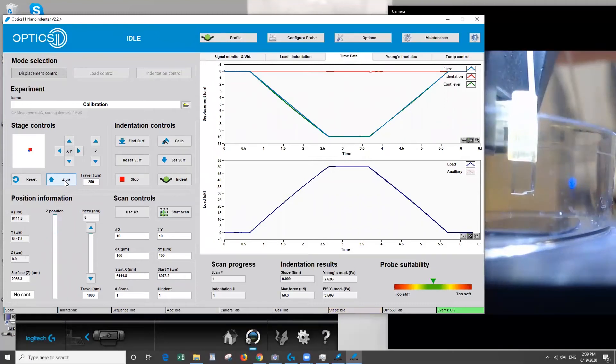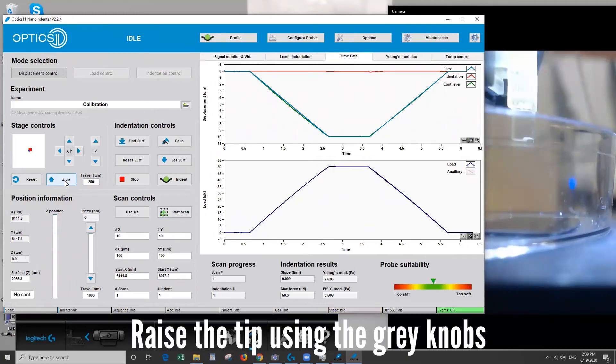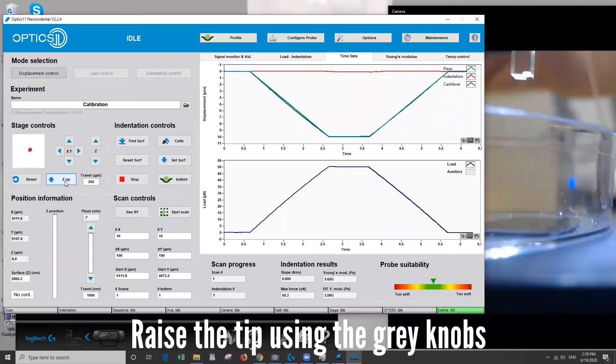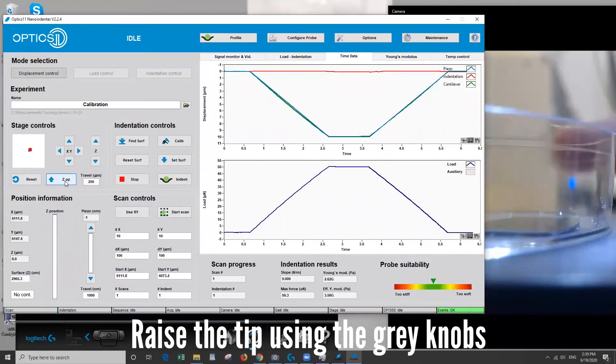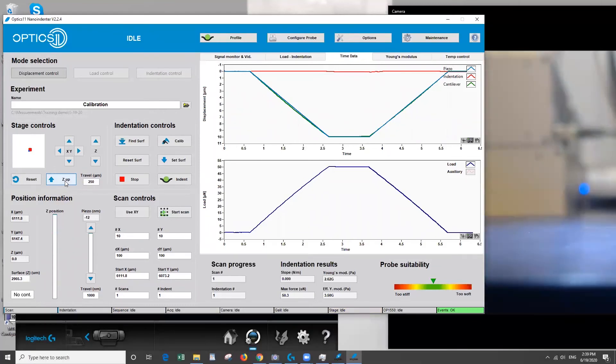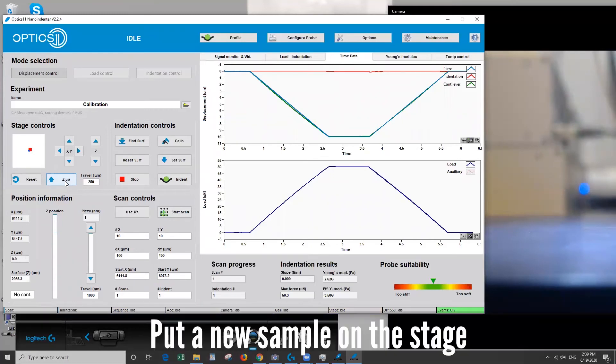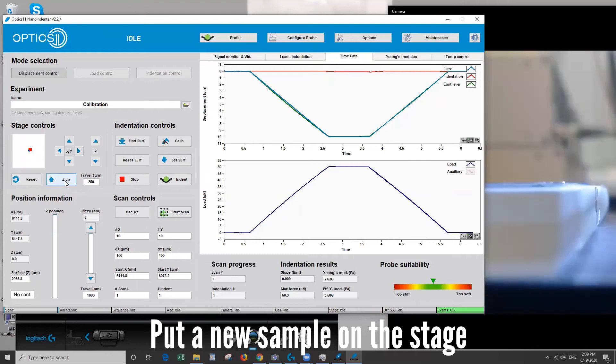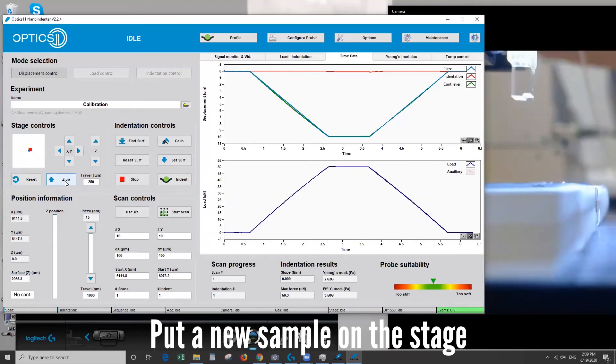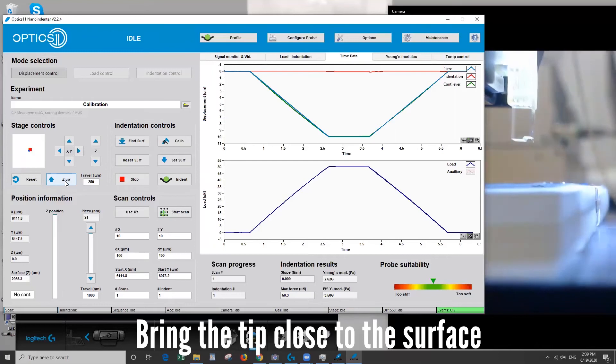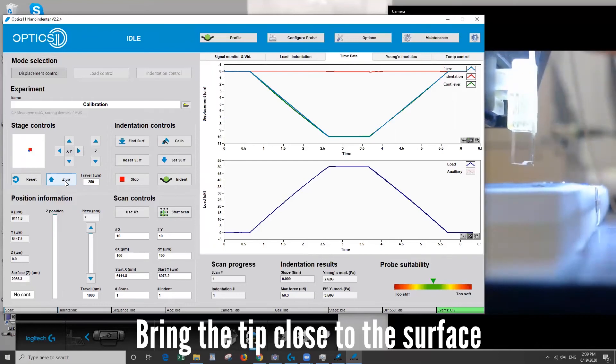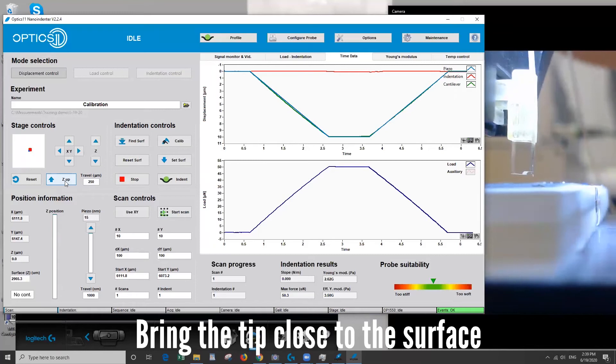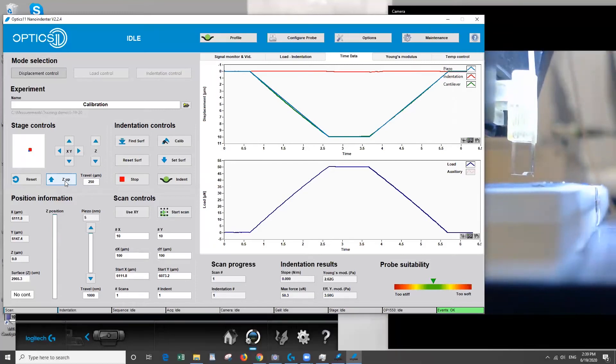Okay I'm going to raise the tip up now and put a sample on the stage. This is a lipid sample I'm going to put on a piece of silicon wafer and what I'm going to do is lower the tip close to the surface. I've propped it up on some glass slides. So we don't need to lower the gray knobs all the way to the max so we'll stop about here.